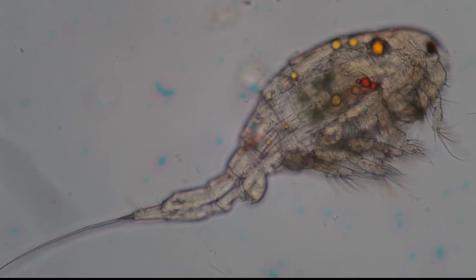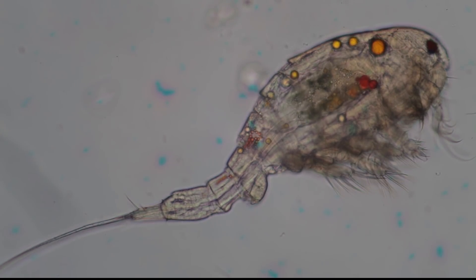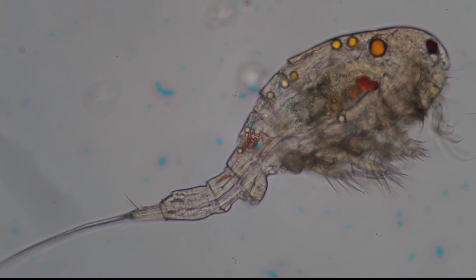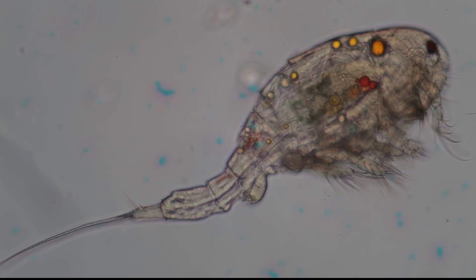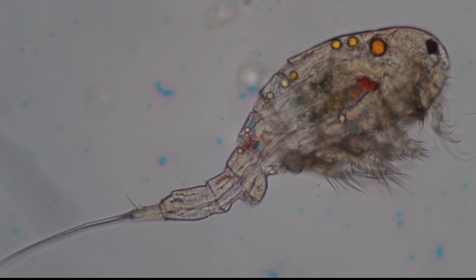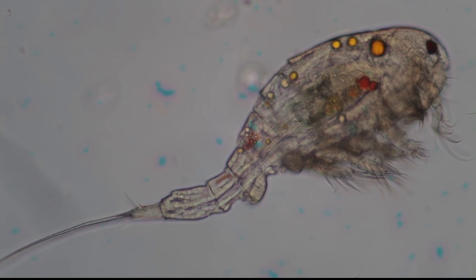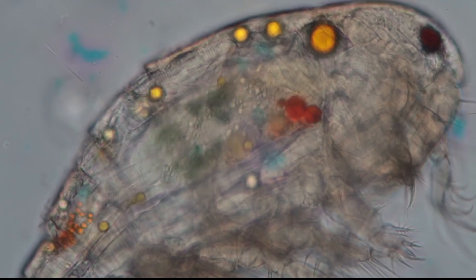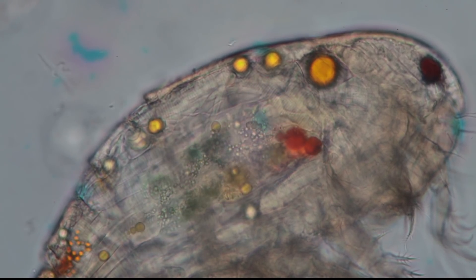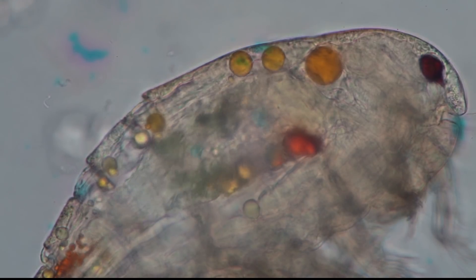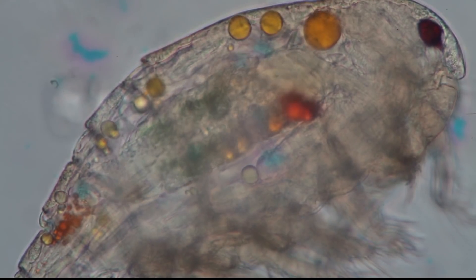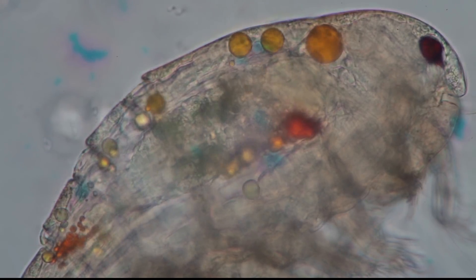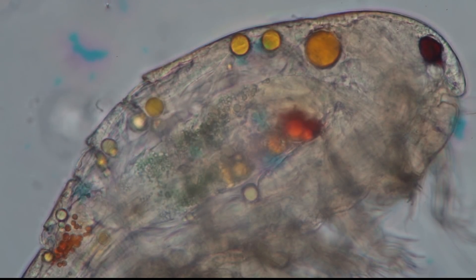This is now in Brightfield. That's basically the same image as you saw before, only now in Brightfield. And you can see that those crustaceans, those little shrimp-like animals, are basically living. And the organs are also moving around. And you can also see sometimes the legs moving. But you can already start to see that there are the little spirilla floating around in the water. I do not really know what these orange circles, these orange dots are. But in any case, in the top right corner, you can actually see the eye of this crustacean, this dark spot on the top right corner. That is the eye.